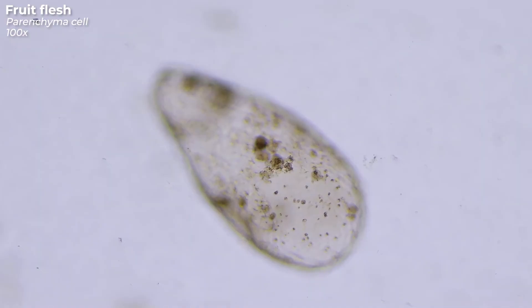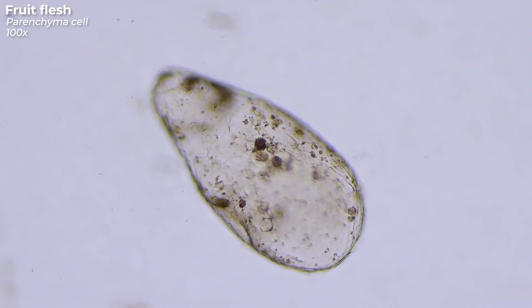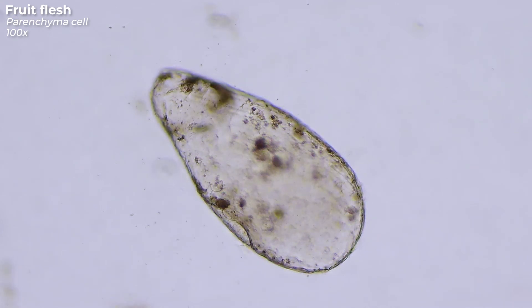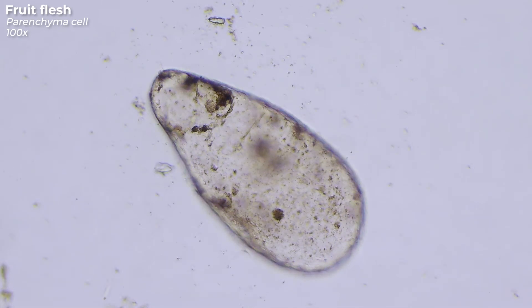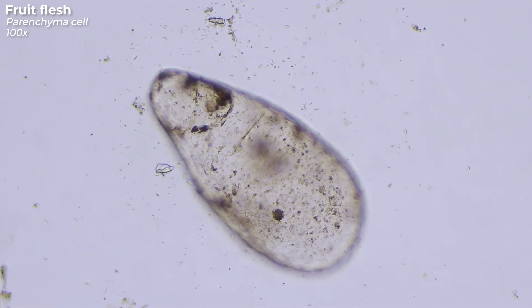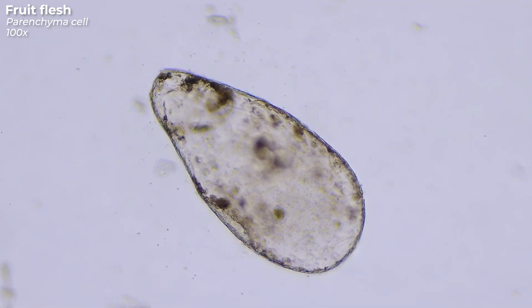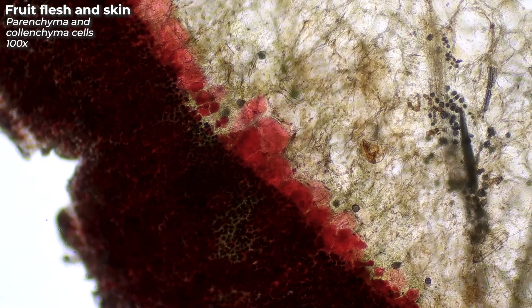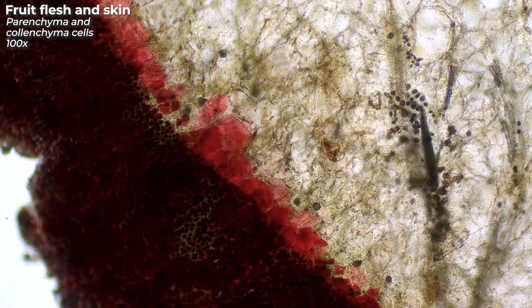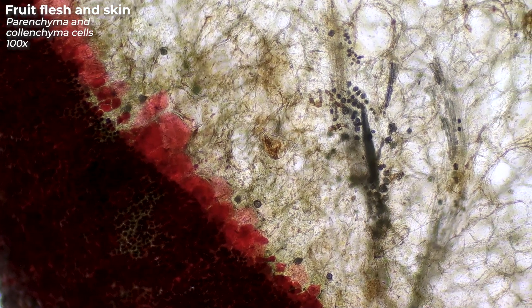It is the parenchyma cells that make the plum so juicy. The cell walls are much thinner than those of the skin, and you notice this immediately when you eat a plum — the skin is much tougher to chew than the flesh. The difference between the cells of the peel, which are stained red by the anthocyanins, and the parenchyma cells of the flesh is clearly visible here.